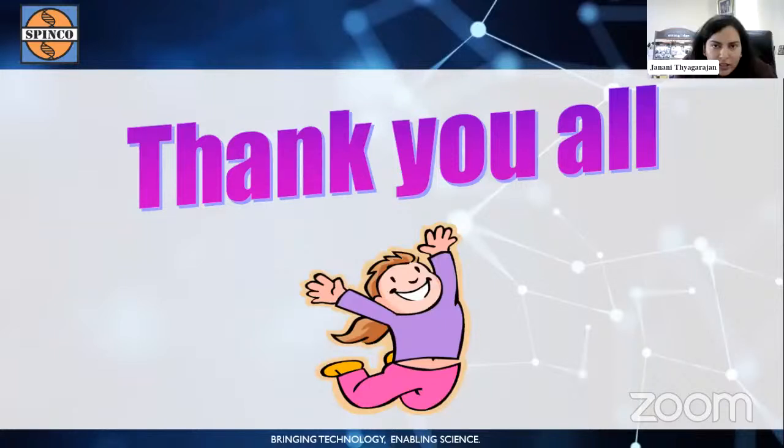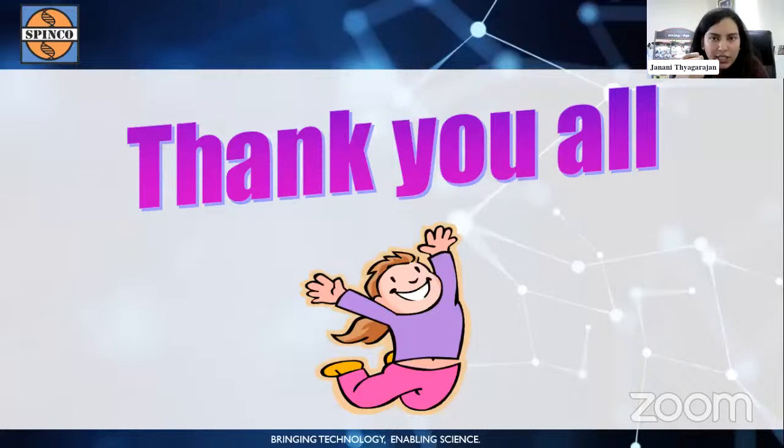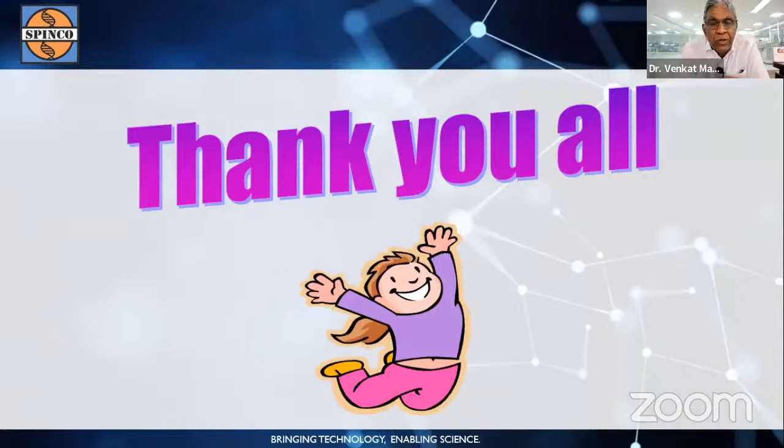We have Praveen Kumar, who's asking, what about 409 in positive and 373 in negative in an unknown sample? So he's gotten an m/z of 409 in positive mode and 373 in negative mode for an unknown sample. I don't think we have any information about the structure in this case. The peaks in positive and negative are different, the ions are different. You have to look at other aspects for interpretation of the data, which we'll discuss in our next session.